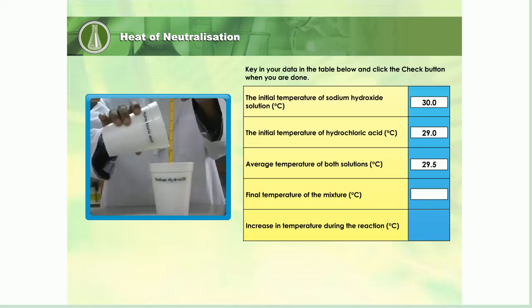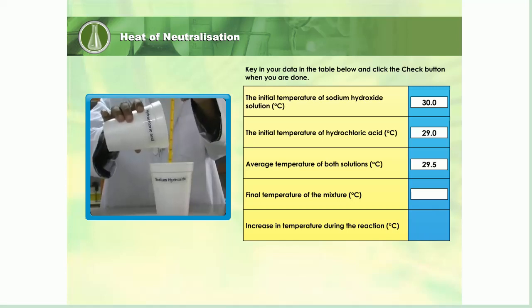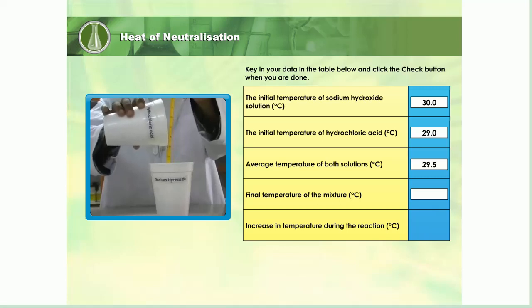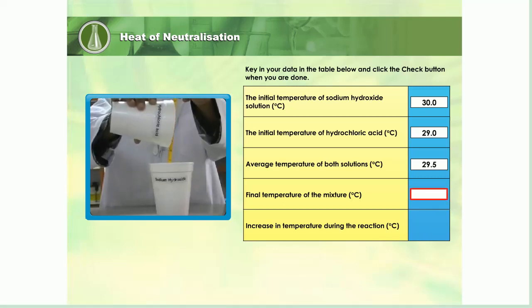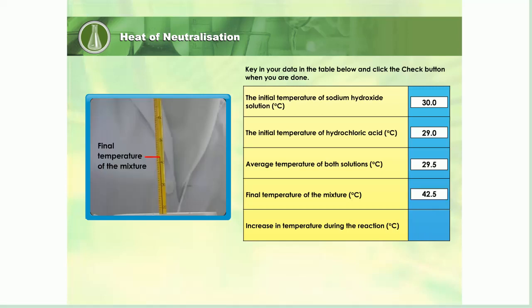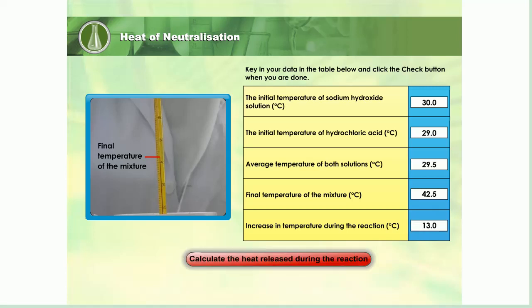Hydrochloric acid is poured into a polystyrene cup containing sodium hydroxide solution. The mixture is stirred and the final temperature of the mixture is measured with a thermometer. Record the reading in the table provided. What is the difference in temperature during the reaction? Key in your answer in the table.